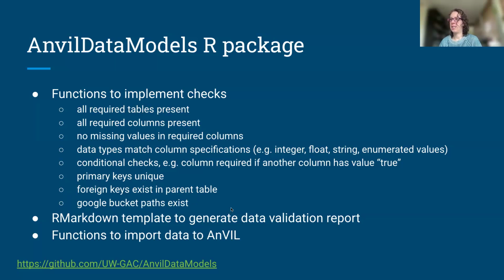And then this package contains an R Markdown template that generates the data validation report. And then finally, it has functions to actually do the import of the data to AnVIL. And this package is available on GitHub.